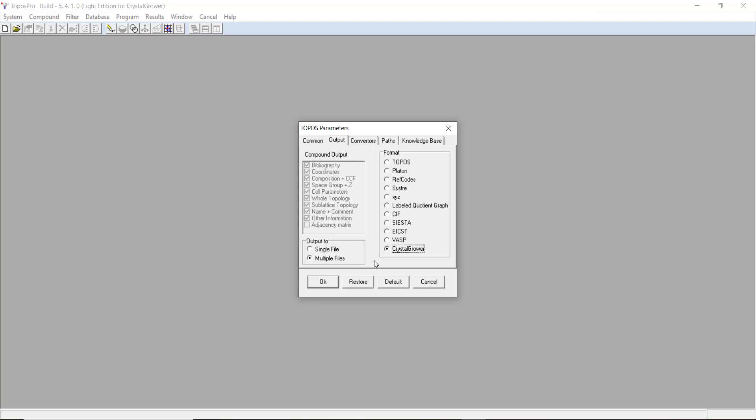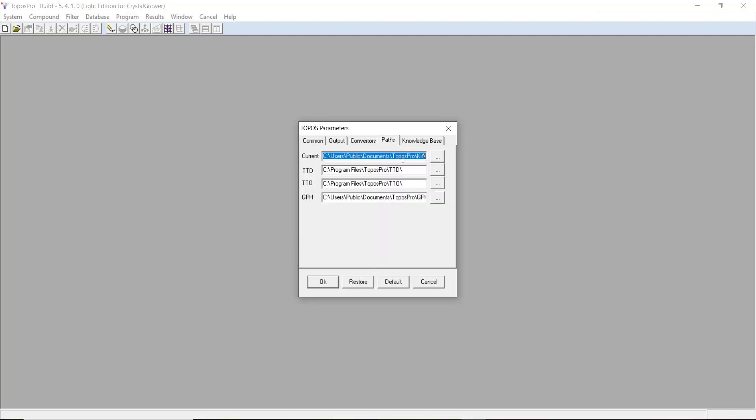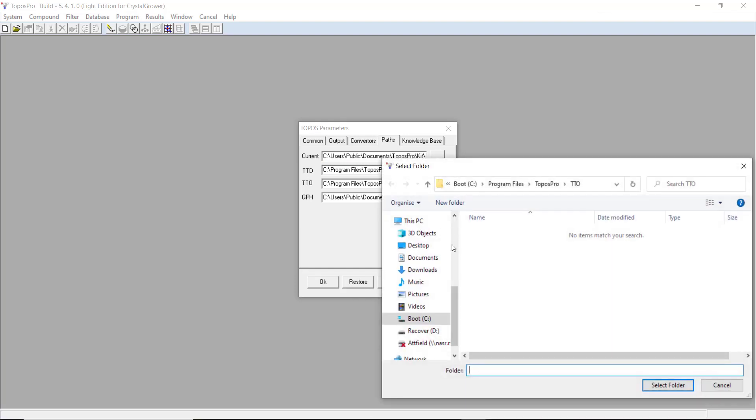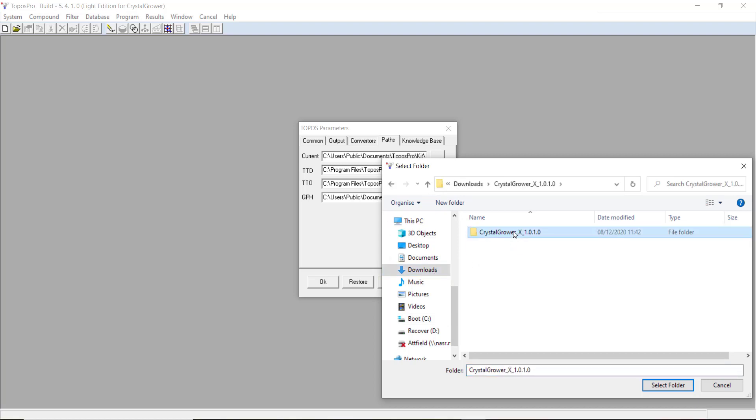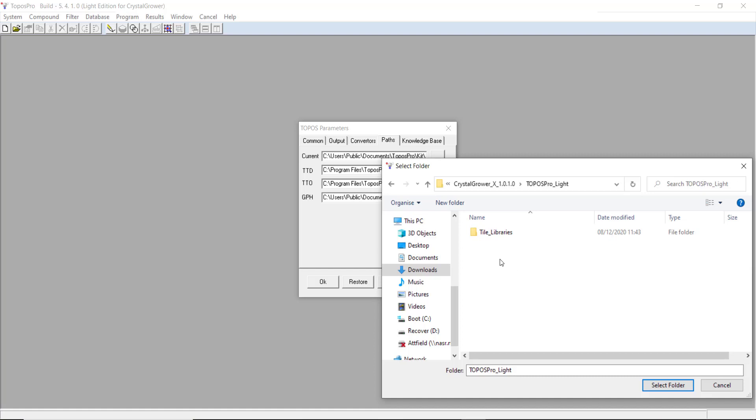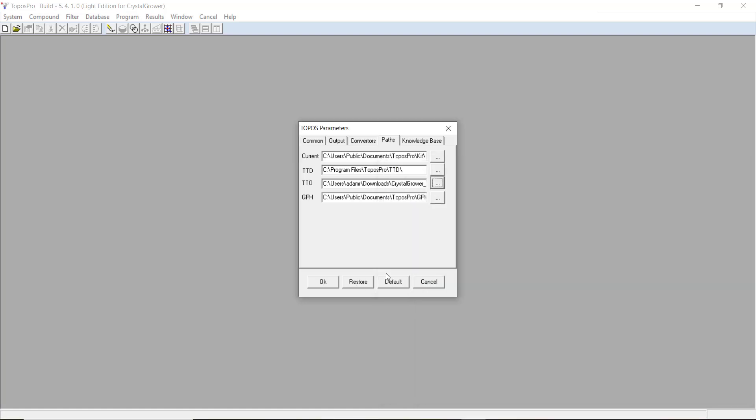The next thing we need to do is give ToposPro the file path to that Tile Libraries folder we just mentioned. If we go to the Paths tab here, and TTO, click the Browse bar there, then I need to look for where my ToposPro Tiles Library folder is. Currently it's just in my downloads, but it may be in a different location on your PC. I just select this folder here, and say Select Folder. And press OK.